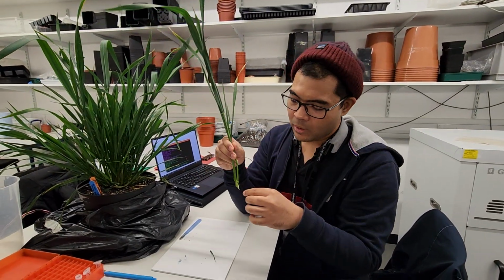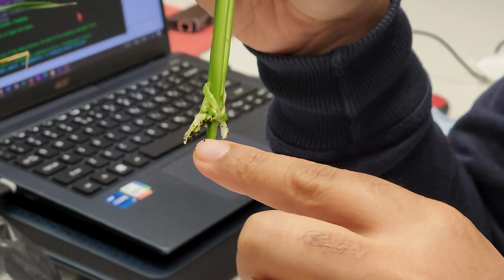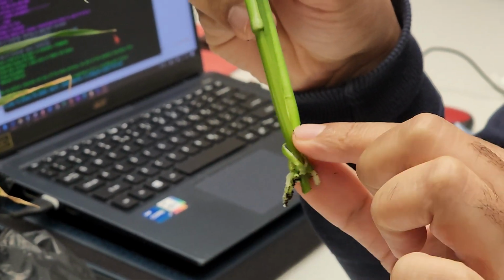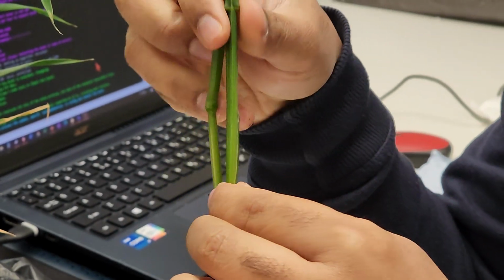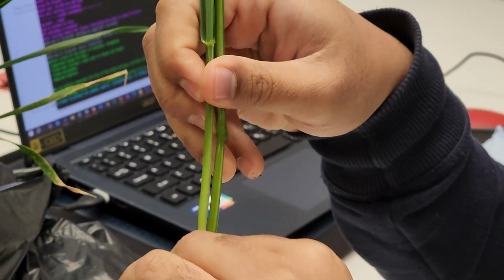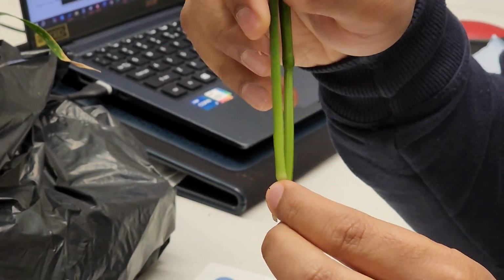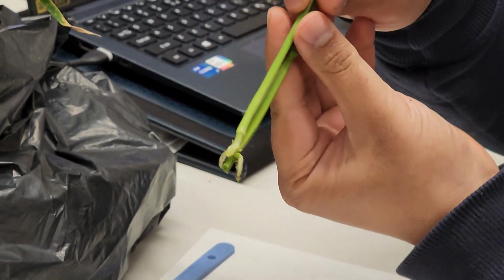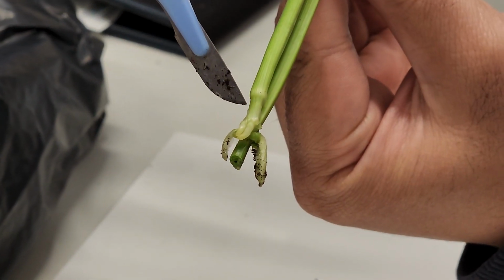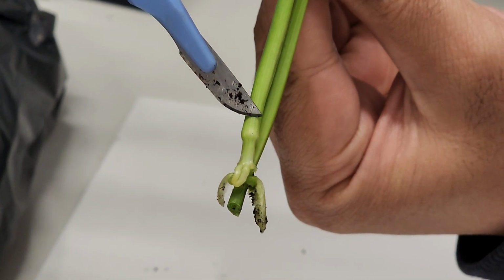How do you know you have reached the base correctly? Because there's a root. Yeah. There's a root there. So I suppose the meristem should be somewhere in there. So we can remove this, just one leaf sheath. So the meristem should be in there. It's also interesting because the stem elongation has occurred now. So the meristem is not in there. It should be in here.